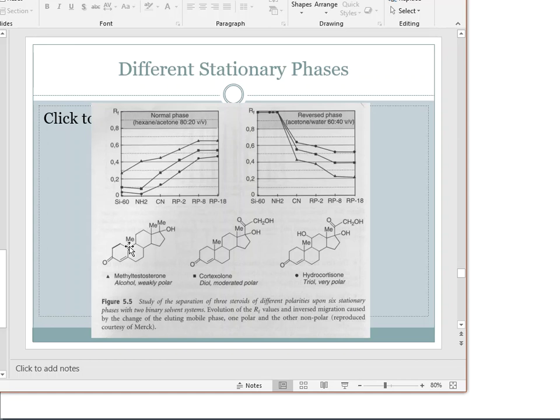The Me stands for methyl group, so a CH3 compound. We see one there and one there and one there, so there's no difference there. In the third compound, we see an OH group pointed off here. And in this OH group, we do not see it there and we do not see it there. So this has maybe some extra polarity that's associated with that part of the molecule.